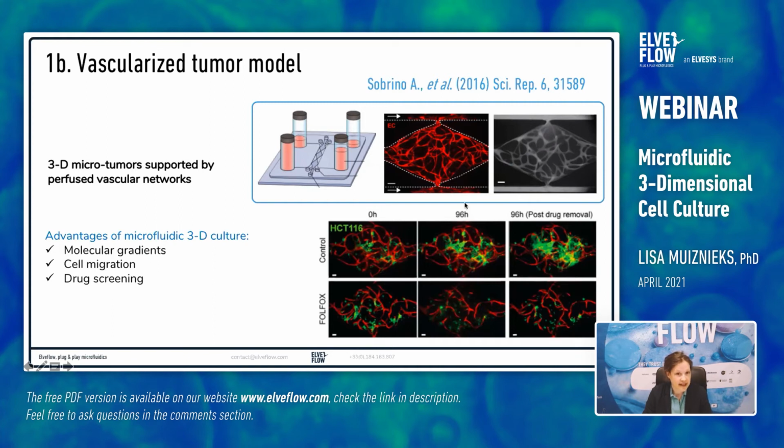By day 7, a tight vascular network was formed, and flow across the gel from one side channel to the other switched from being interstitial to intraluminal, shown by the flow of FITC-Dextran here in gray.